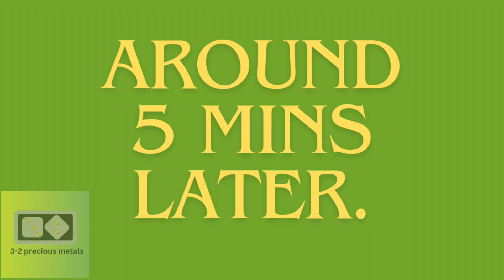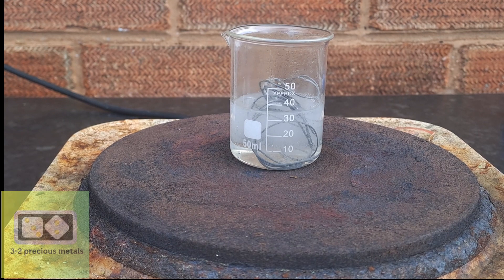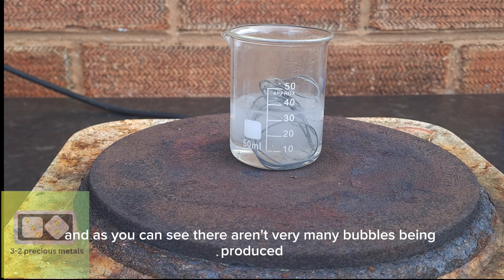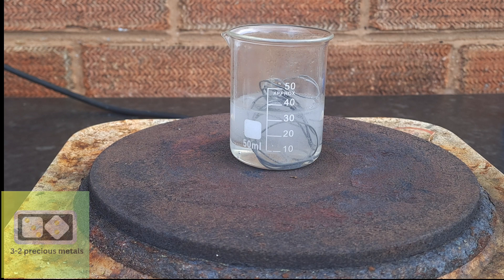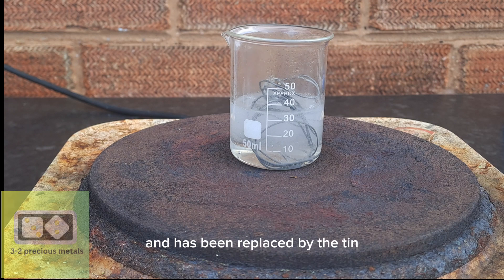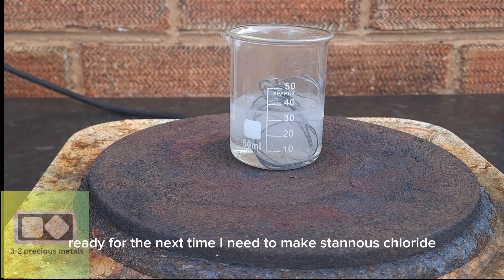Around 5 minutes later, a cup of tea has been drunk, and as you can see, there aren't very many bubbles being produced. This means almost all of the hydrogen has left the solution and has been replaced by the tin. There is still a great deal of tin remaining, which will be rinsed and put into a tub ready for the next time I need to make stannous chloride.